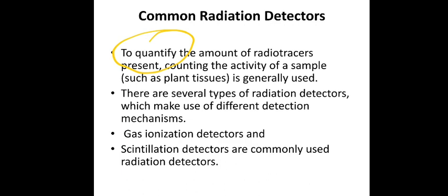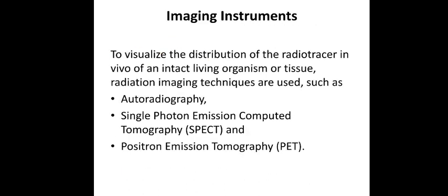A suitable detector should be used. This is one way, one technique of radio tracing. The next one is imaging. Radio tracing can also be used to get an image.